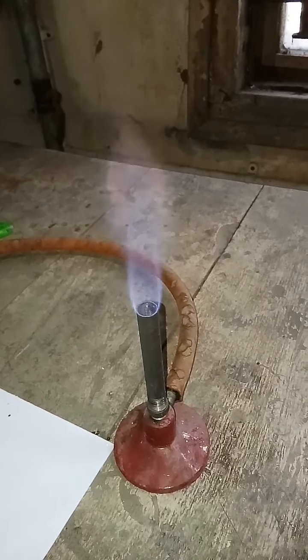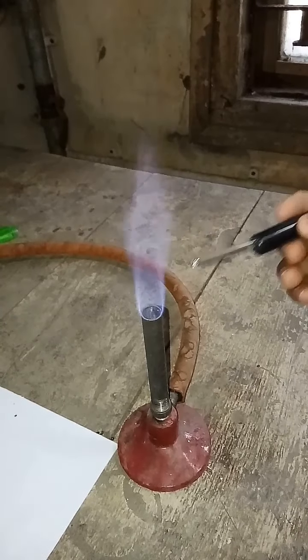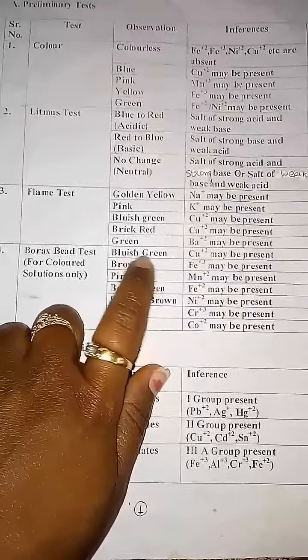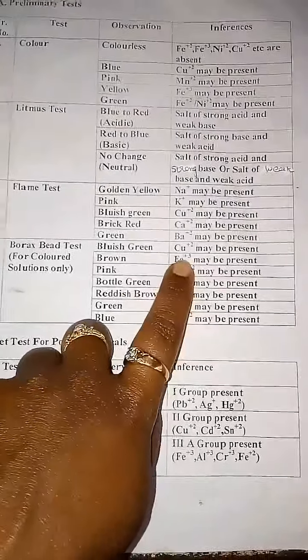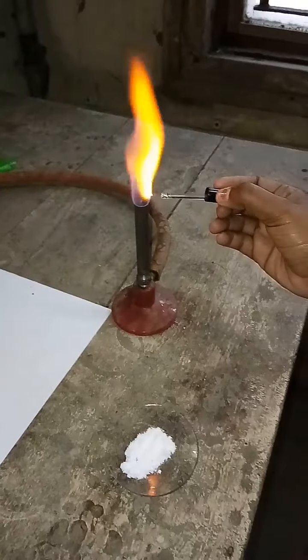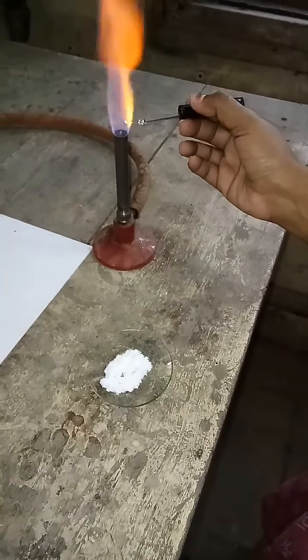For the flame test, first you have to clean your platinum wire with concentrated HCl solution. Dip your platinum wire into HCl solution and heat it. Do this process 2 to 3 times. After cleaning the platinum wire, you have to take a mixture of OS plus HCl — you can use concentrated HCl. Add a small amount of acid, then add OS, and heat this mixture in the flame and observe the color of the flame.